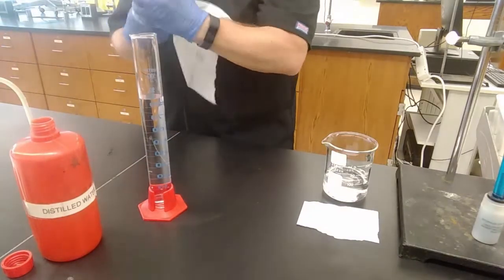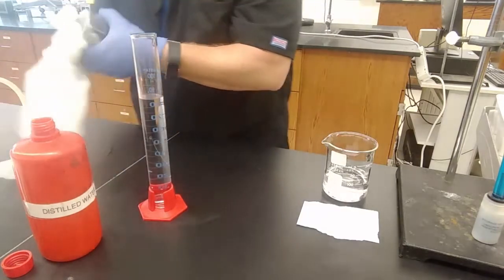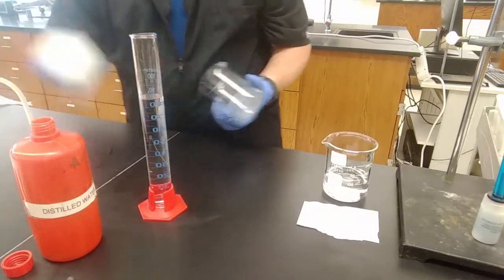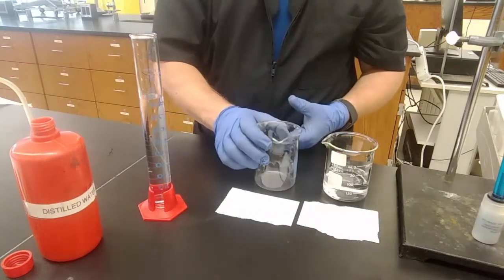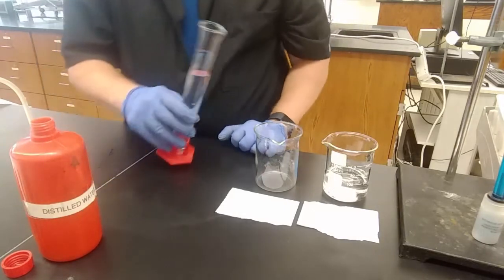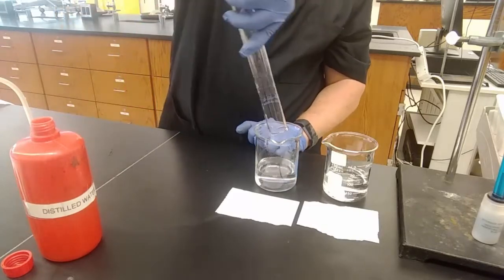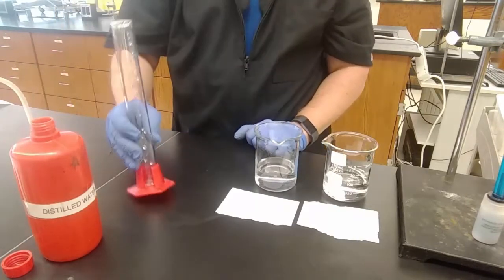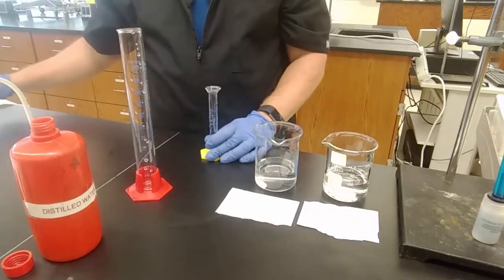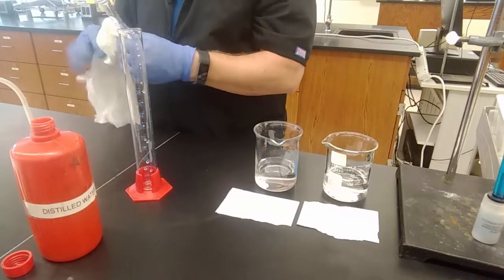Second 250 milliliter beaker. Labeling this beaker 1. And I'll put the 90 milliliters of water in here. Get my 10 milliliter graduated cylinder, which is clean and dry from the last experiment. Cleaned, not so dried.